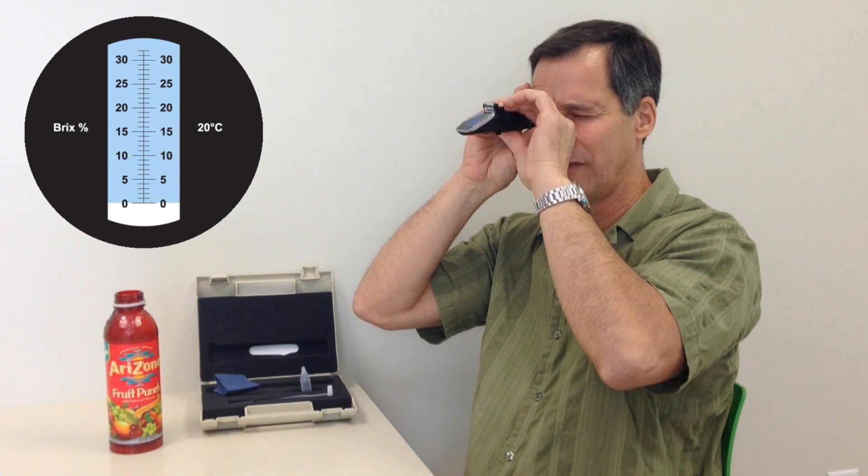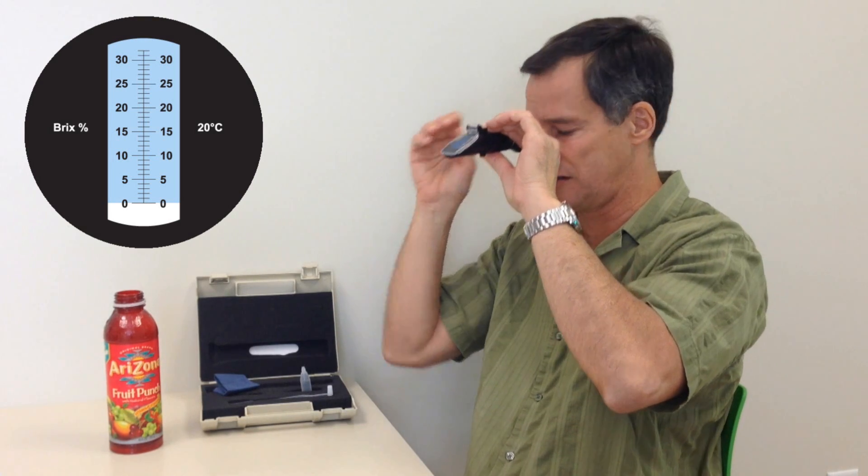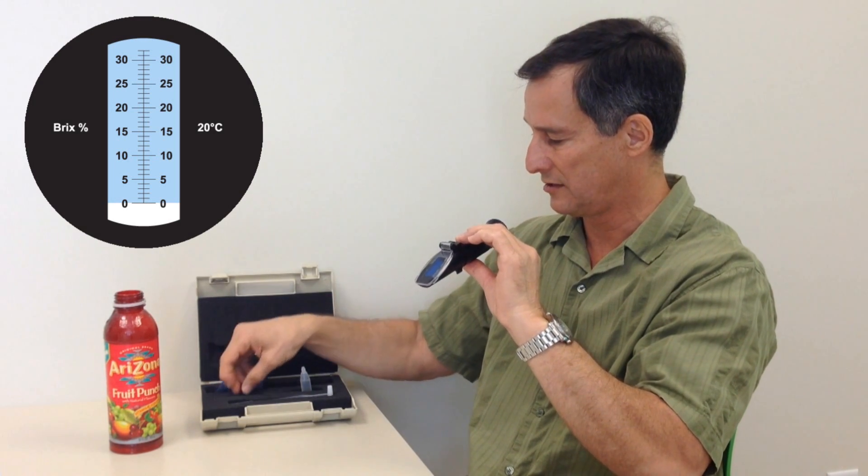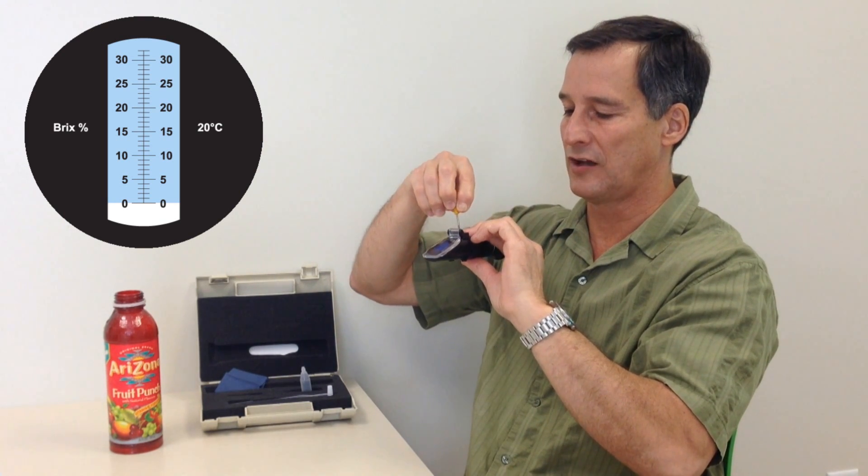I need to have the divider between the blue and white fields on zero, since we're dealing with distilled water, which has no sugar in it, no dissolved solids.